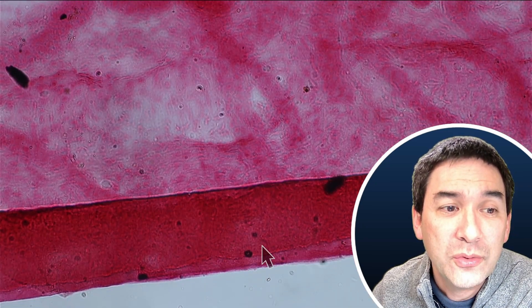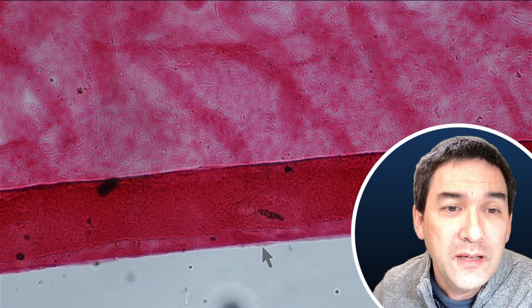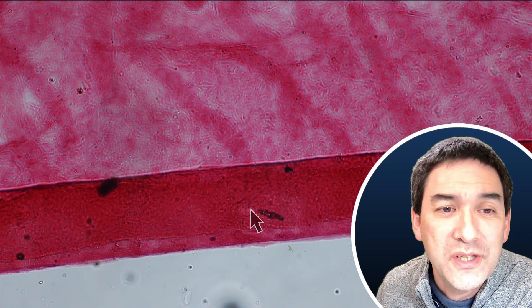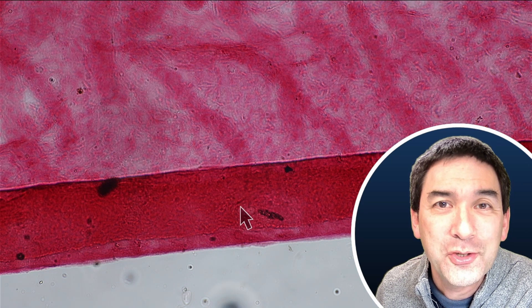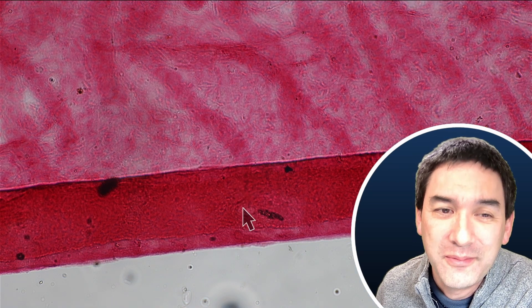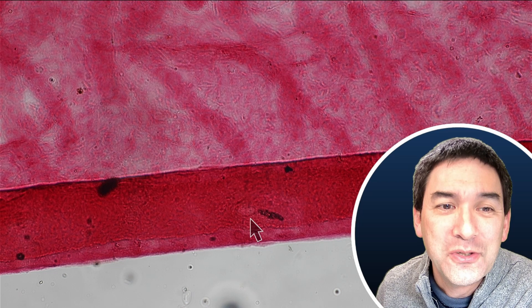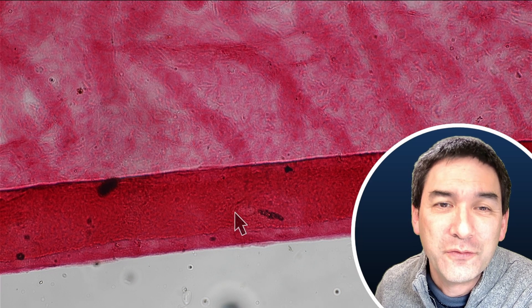When we go to the surface, occasionally you can see there is a small, tiny little opening here as well. I can imagine this opening is the opening for this particular duct. So it's a little bit difficult to see, but I do think that these are secreting some substances to the surface of the skin.